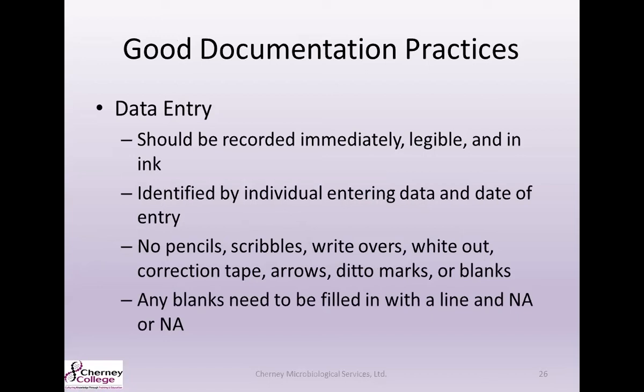Let's go over some good documentation practices. Documentation plays a very large role in GLPs, so make sure that all the data in the lab is recorded legibly and in ink, and record all of your data immediately. Make sure you're not using any pencils. We don't want anything that can be erased. No scribbling, no write-overs. Don't make that 5 that you wrote look like a 6. And any blanks that need to be filled in with a line, make sure you just NA it, and you're also going to want to put your date and initials.